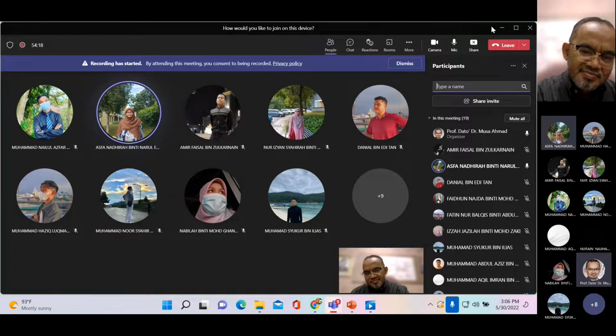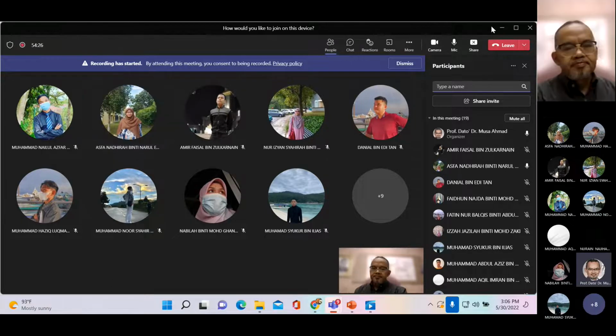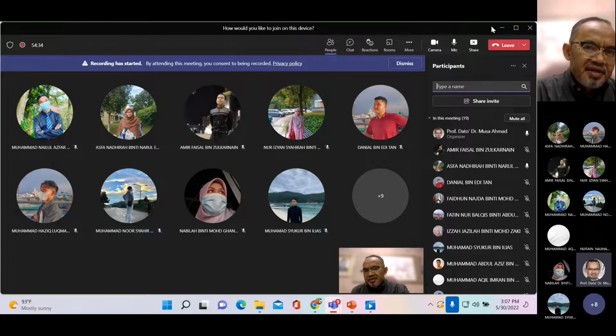From what I understand, the light will go through the sample and then it will give a reading. How does it give a reading? What is the phenomenon involved?